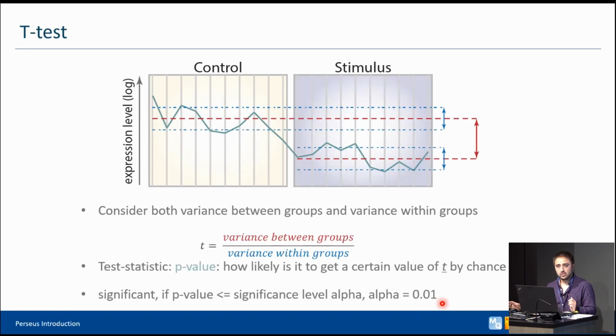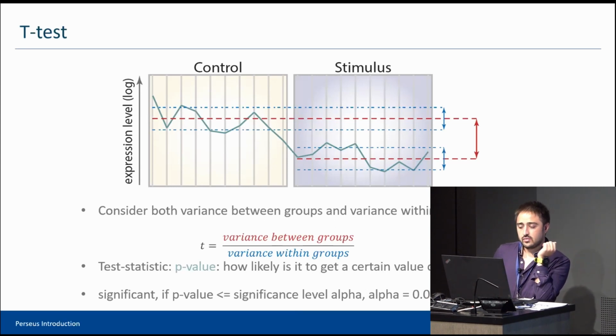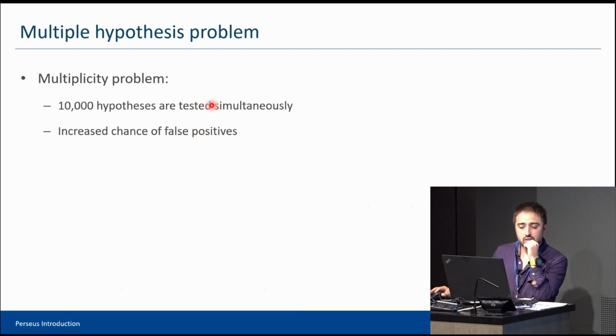But it's actually just half of the story, because the p-value is a probability. And a probability means that it's not for sure that it will happen, but sometimes. The way you interpret a probability of 1% is, if I run the experiment 1 billion times, then 1% of those will have this characteristic. It has to be in big numbers, right? If you do the experiment many times, then you are expecting this ratio to take place.